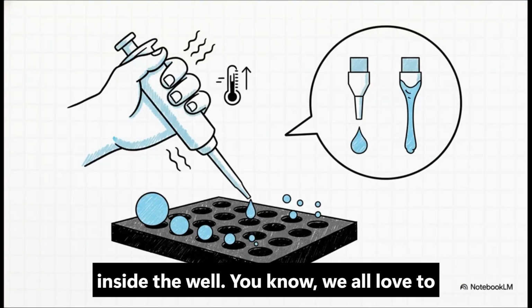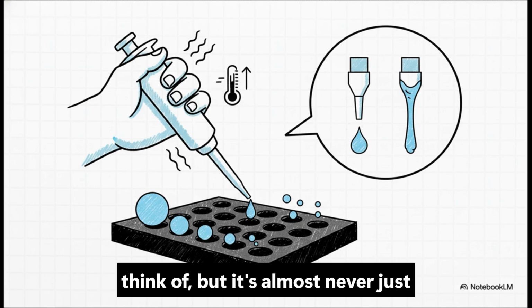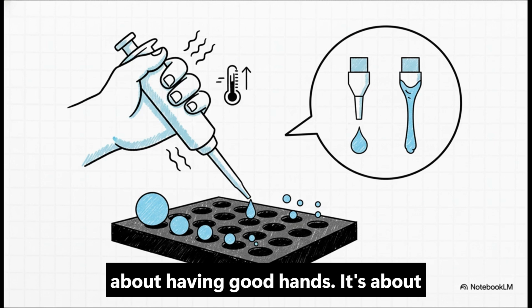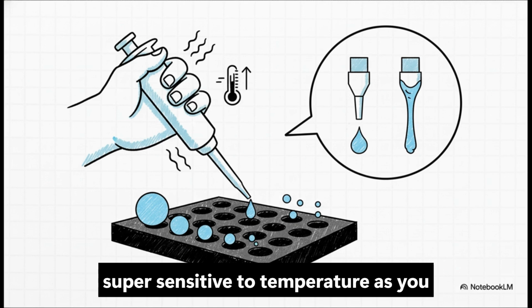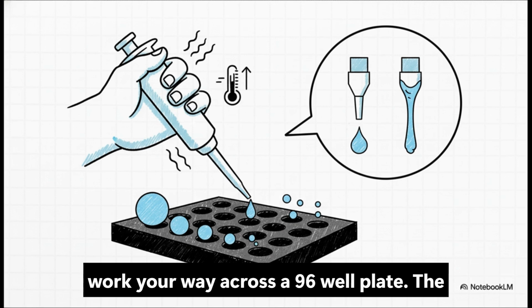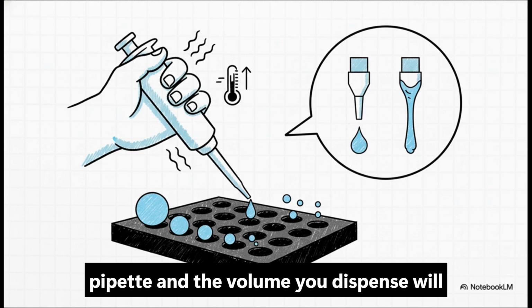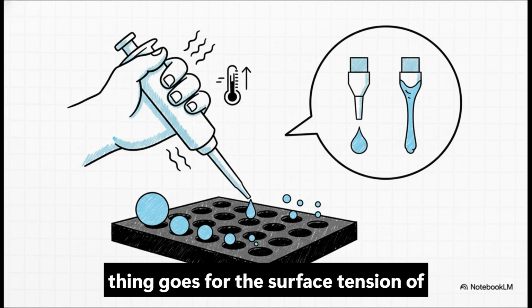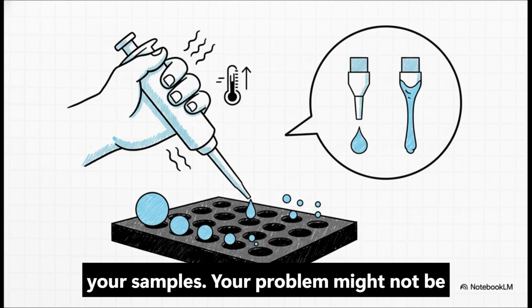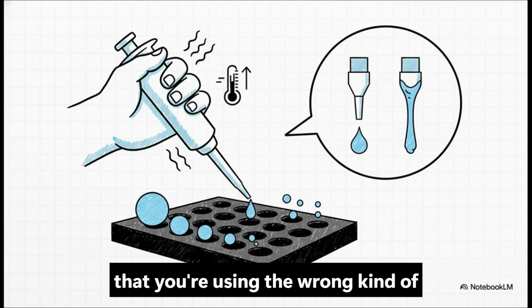You know, we all love to blame pipetting. It's the first thing we think of, but it's almost never just about having good hands. It's about physics. An air displacement pipette is super sensitive to temperature. As you work your way across a 96-well plate, the heat from your hand actually warms up the pipette, and the volume you dispense will literally drift. It changes. The same thing goes for the surface tension of your samples. Your problem might not be your technique at all. It might just be that you're using the wrong kind of pipette tips for your matrix.